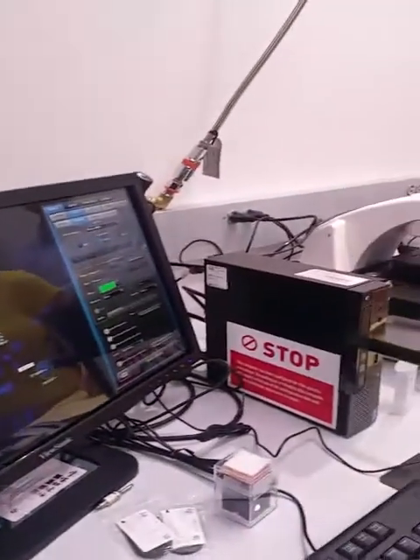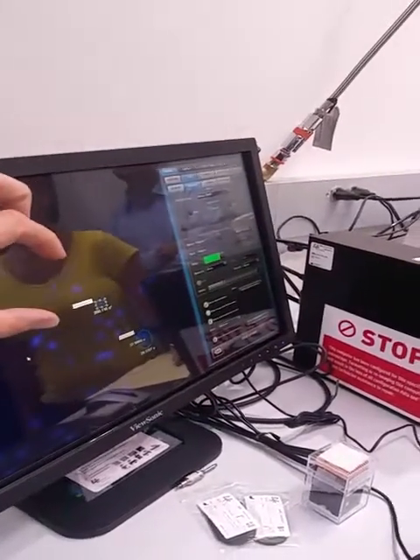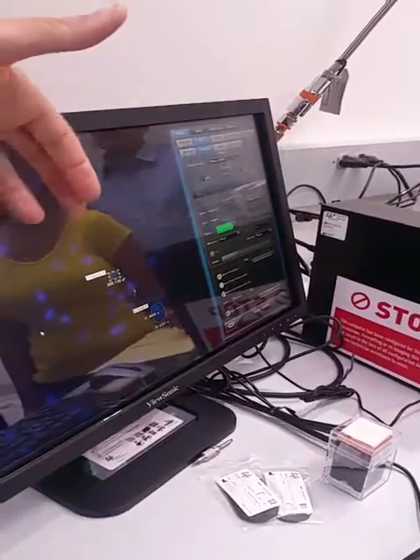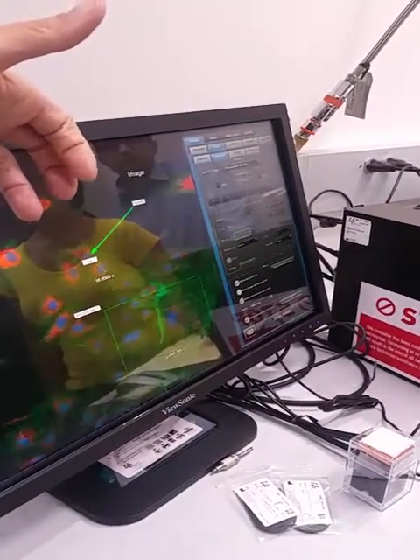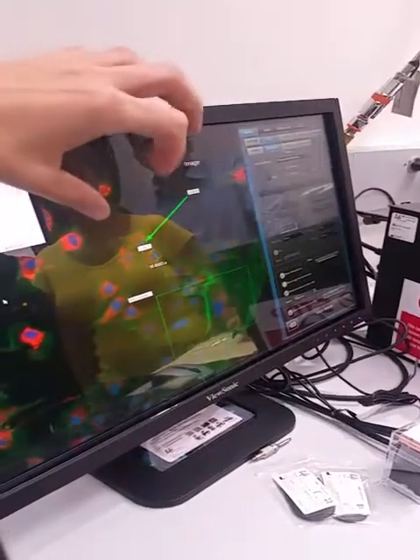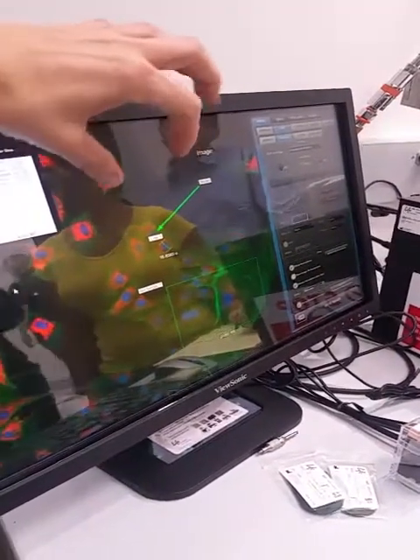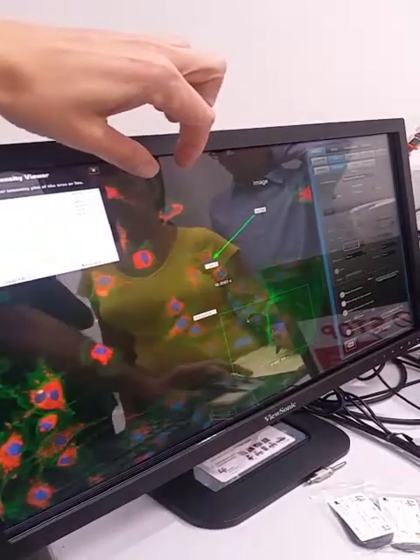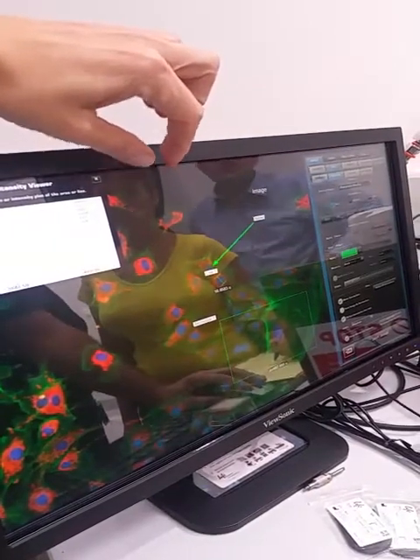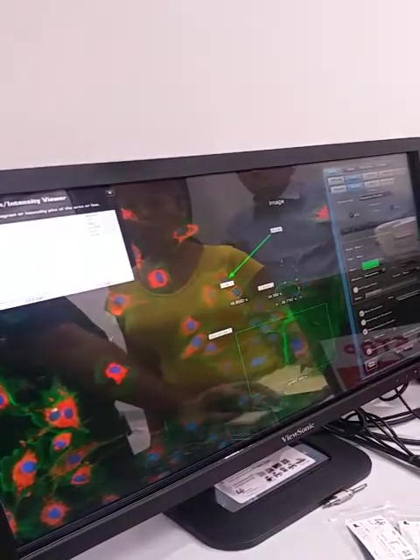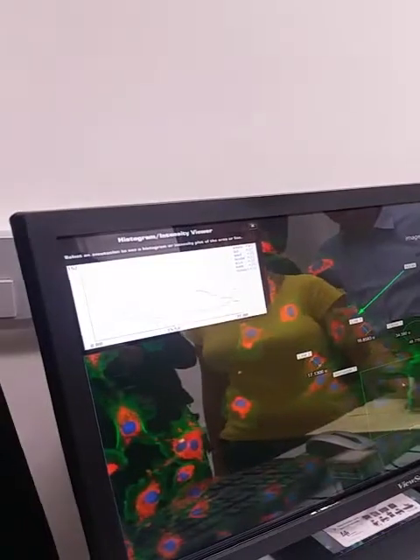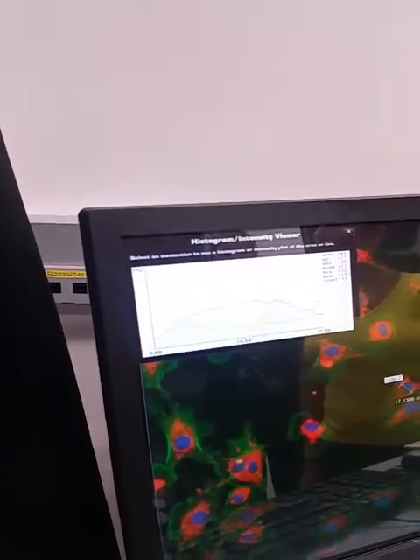Is there a tool that lets you draw? Let's say you want to measure the amount of red. You can't isolate just the red within an overlaid image using these area tools — it's going to give you the full overlaid image. With the line tool, you can see intensity on individual line channels, but you can't measure intensity for a selected area within the overlay.